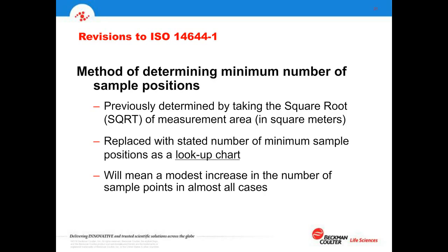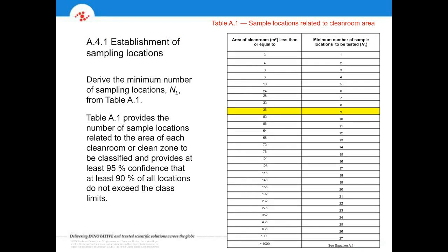As we looked at that from the statistical side in the group, we finally determined that that really wasn't quite sufficient. It gave us maybe 80-odd percent confidence, but really not the 95% that we were trying to achieve. So with the help of some consultants in statistics, one from Denmark, one from Japan, another from the U.S., it was determined that we needed to increase that, and we really needed something more like a chart in order to carry out that improvement in the statistical reliability.